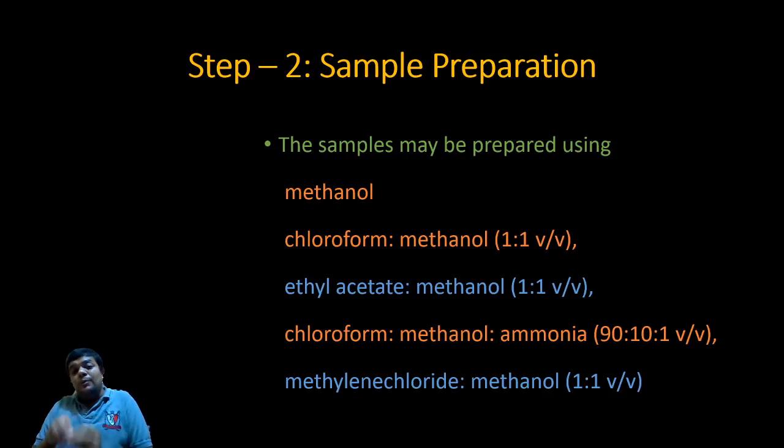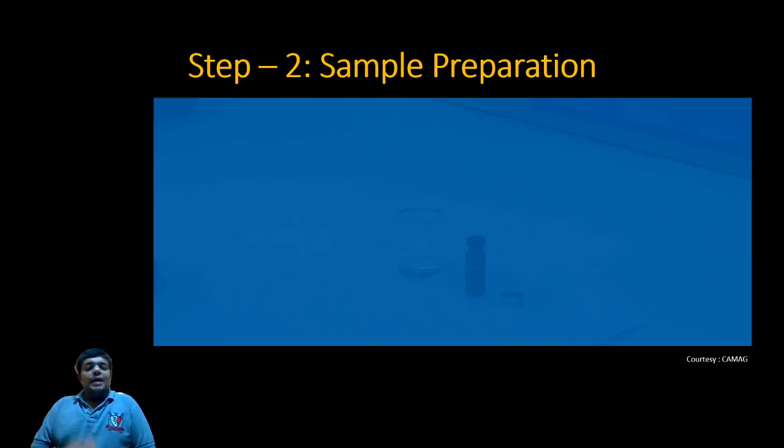So I am just showing you that you can use one solvent as a solution in which you can dissolve your sample, or even you can use a mixture of two or three solvents to prepare a solution. Now, as we are preparing a solution, we should closely look at what precautions we should take while preparing a solution. And for that, I have a very small video for you. You just look into it carefully and see how we are preparing a sample.